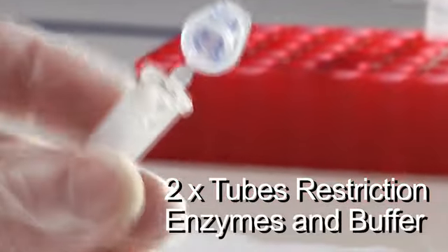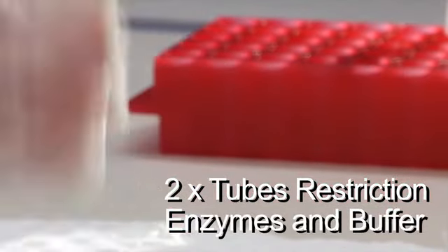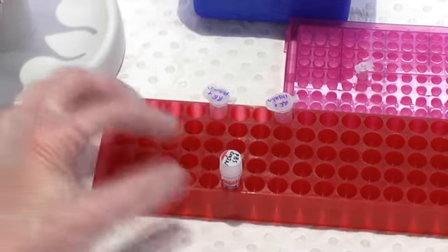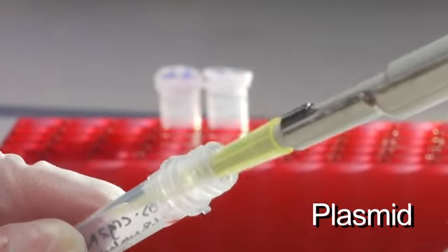Restriction enzymes are naturally used by bacteria to cut up any invading DNA. But we're going to hijack them and use them for science. To start the process, I have to prepare two tubes of restriction enzyme and buffer.